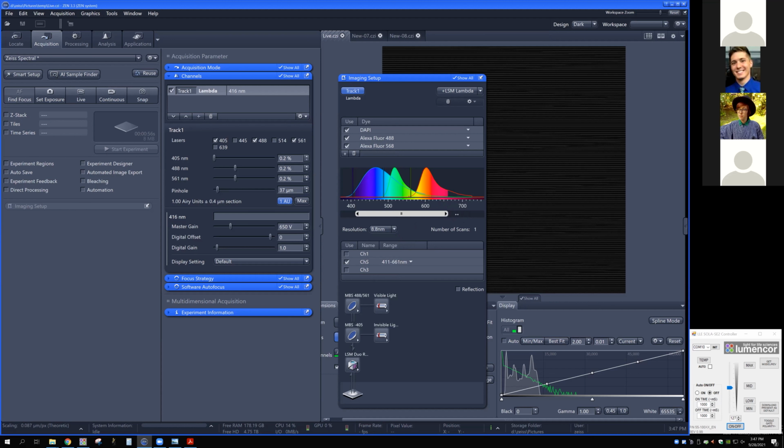Just like before, I can impose on my spectral detector a bit if I want to, but there's really no reason to in this case, because we're doing everything in a single scan. The only reason would be to maybe reduce file size a little bit. But these tails for spectral can really help to identify the fingerprint for each one of these fluorophores, which can be quite helpful.